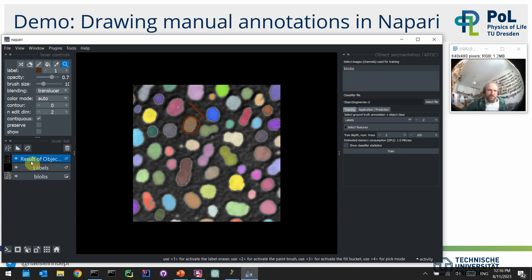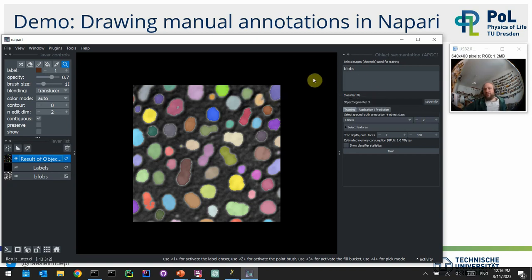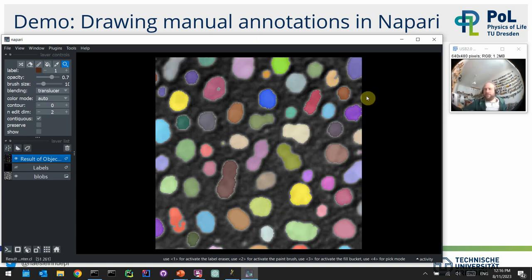The segmentation result looks reasonably good. I recommend hiding your annotation layer to avoid confusion, so you only see the original image and the segmentation result. Before moving to the next step — applying another plugin — I also recommend closing side windows when you're done with a step. If you have more than three of these open, it becomes confusing.